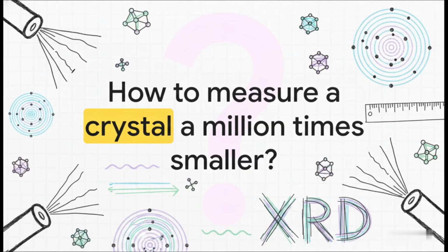The wavelengths of visible light are literally just too large. They wash right over atomic-level structures. So we need a tool that operates on that same incredibly tiny scale. And that is exactly where X-ray diffraction, or XRD, comes in as our ultimate high-tech solution to interrogate the fundamental building blocks of these nanomaterials.